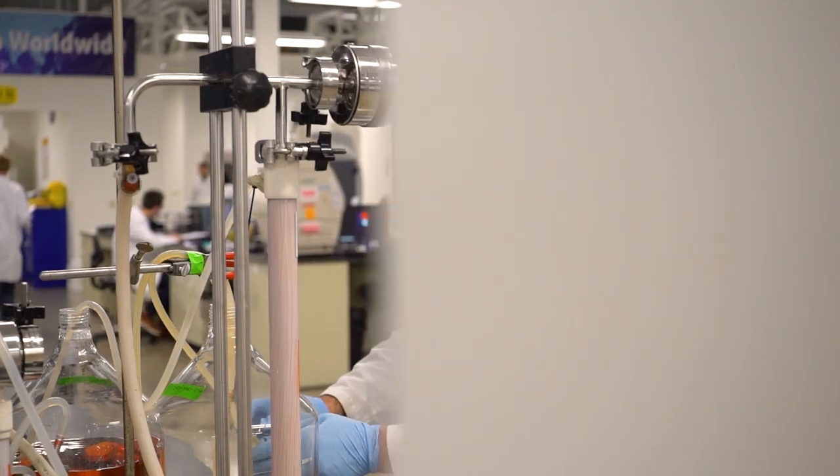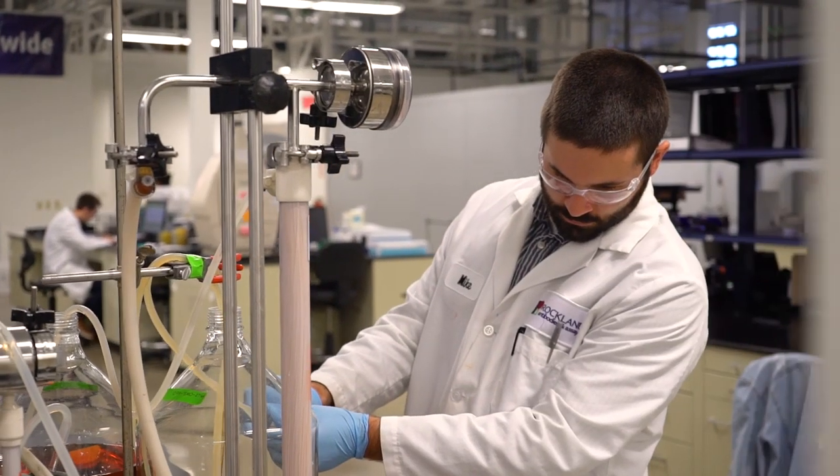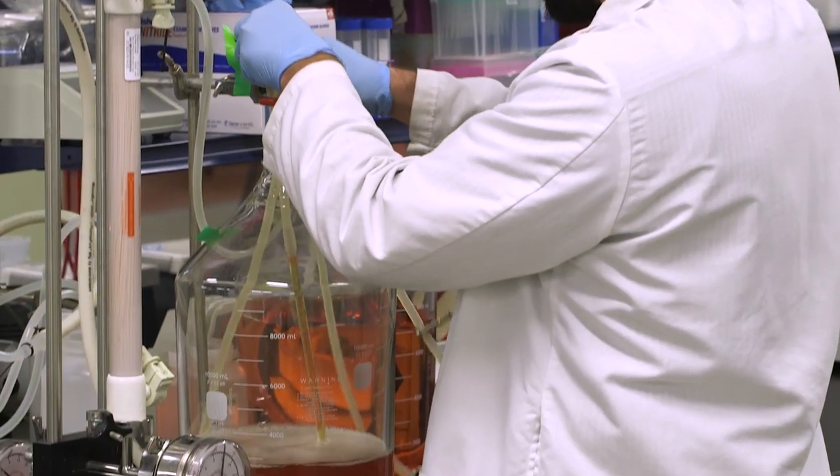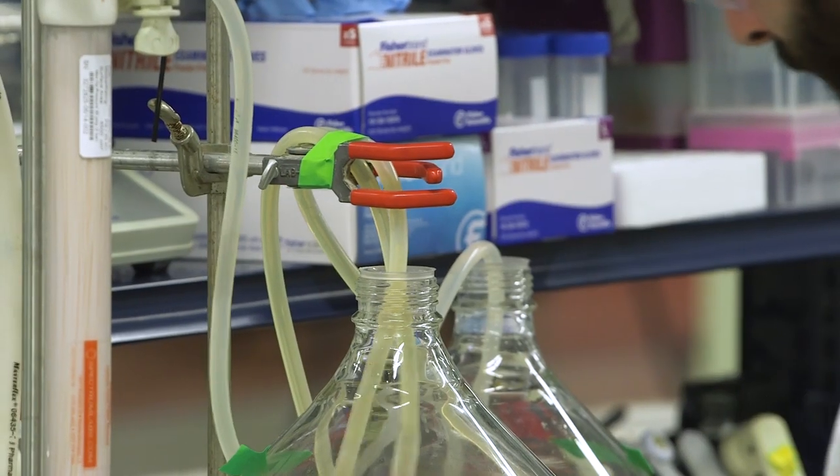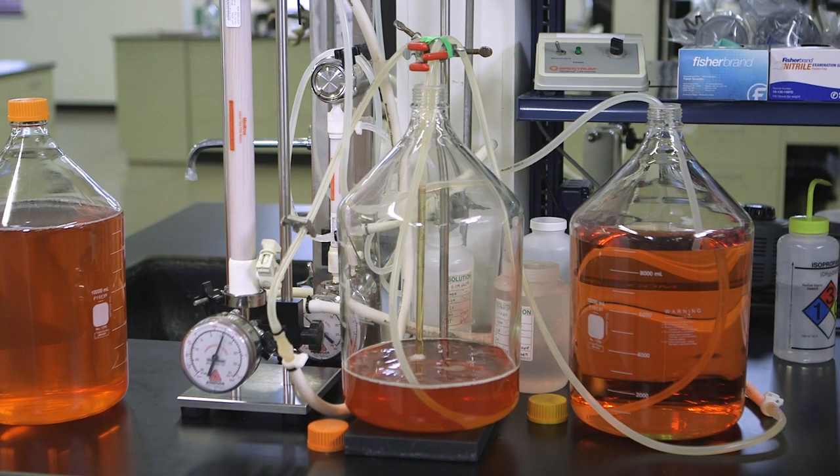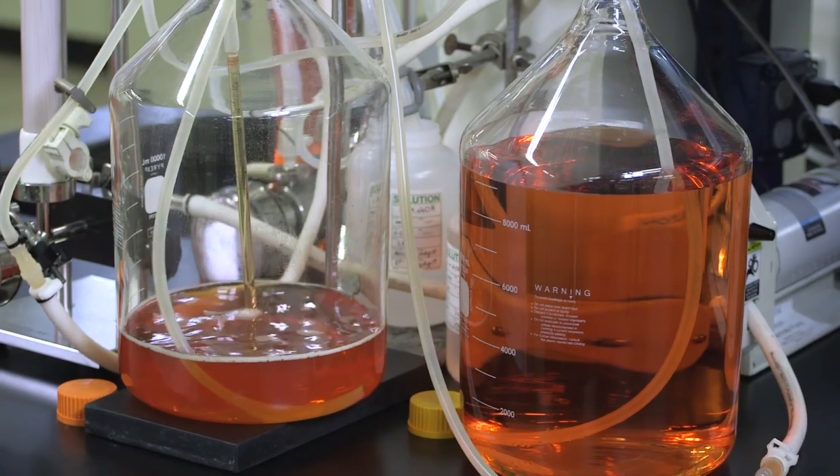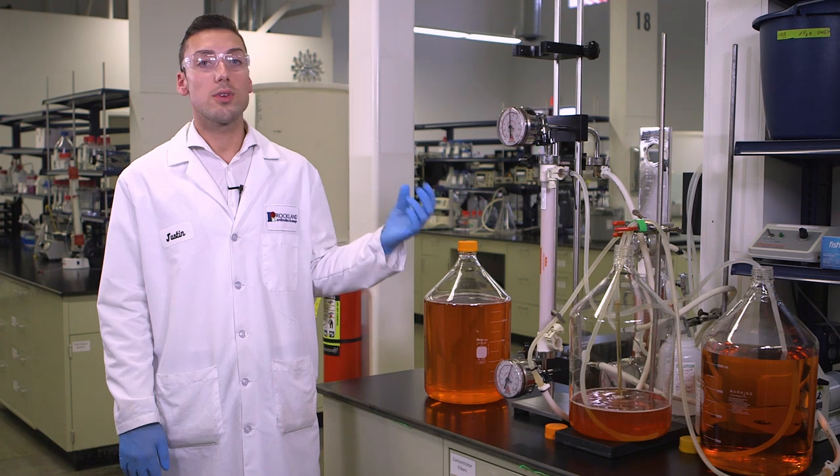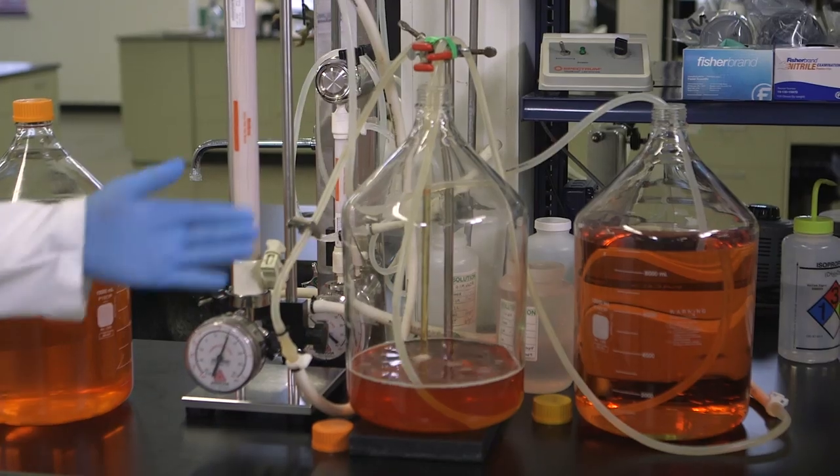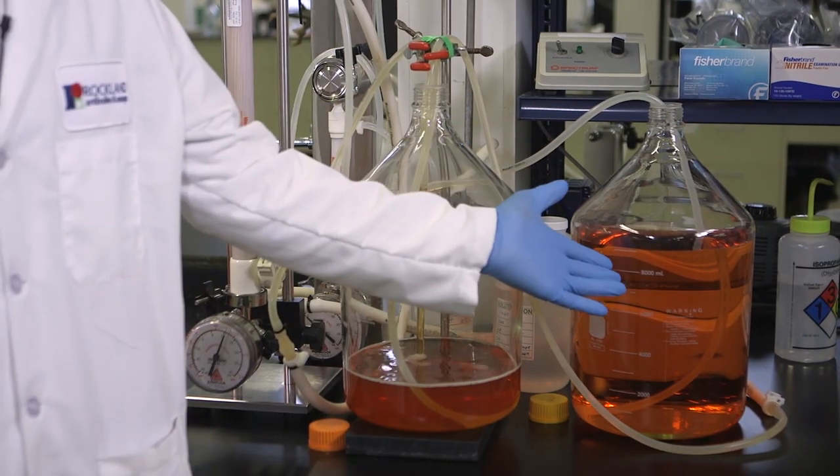The production supernatant that's collected from our production suite is then concentrated down to a 10x or 20x volume for the purification team to have a highly concentrated smaller volume sample to pour over their protein columns. We do this via tangential flow filtration which uses a column with hollow fiber capillaries that will separate out the antibody from the media.